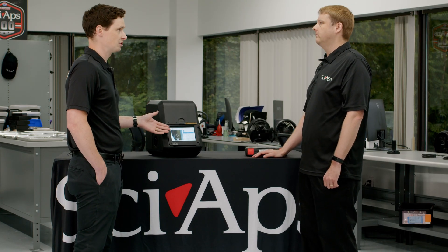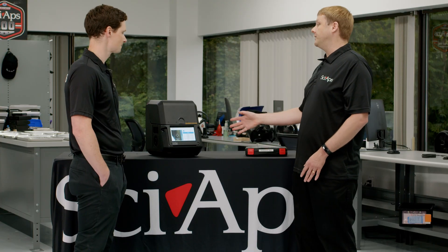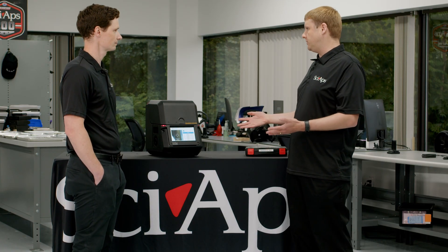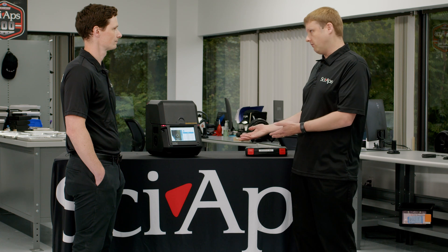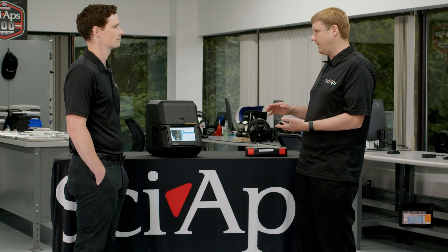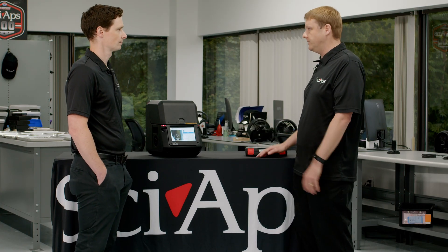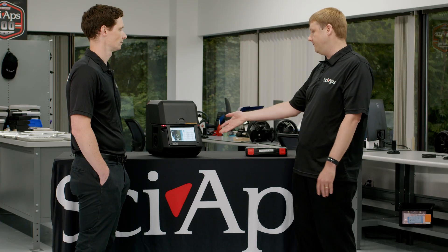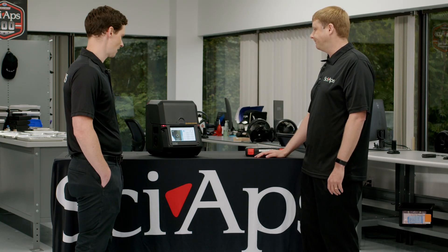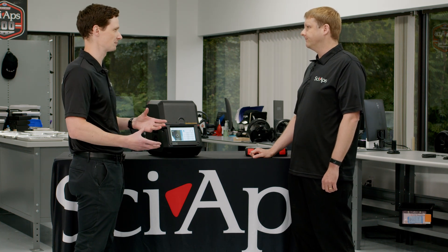We started this test in the Geochem app, which is kind of a new piece of software for CyApps. We're also launching our new Geochem app alongside the Powerhouse Analyzer. This version has three beams in it, which covers a really wide range of elements you might want to measure. In addition to rare earths, which are really important to test on the Powerhouse, you can also test your base metals — more common elements like iron, zinc, copper — as well as light elements down to aluminum, silicon, phosphorus, and sulfur. It uses a mix of fundamental parameters and empirical calibrations to get the best results on every element.